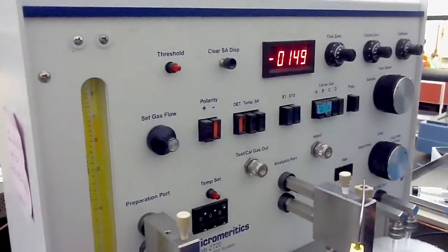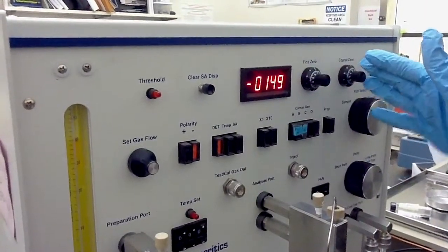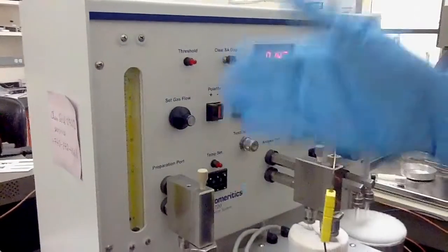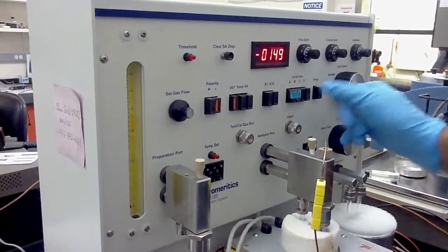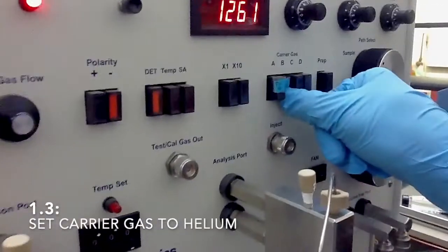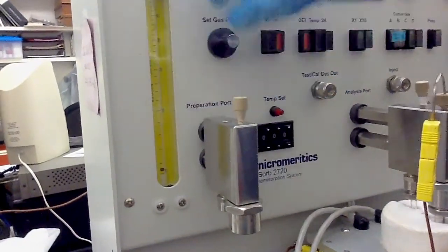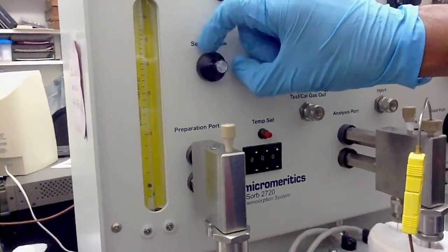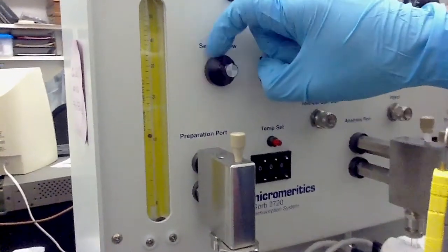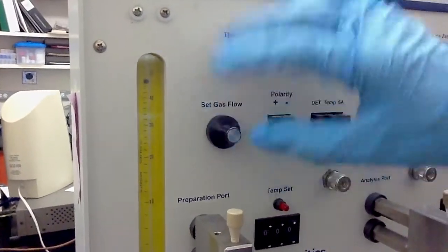Once we turn on the instrument, this meter will show the TCD signal, and we have to turn on the gas to set it, adjust it, and stabilize the zero point, to make it zero. So we will run helium here first. This is the helium gas, and if you look, there is a float which will go up if we raise the flow rate. So we are going to increase the flow rate, and all the way up it will hit. We have to set what flow rate we want.